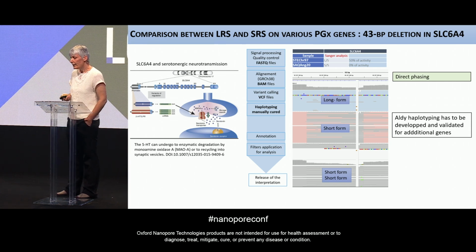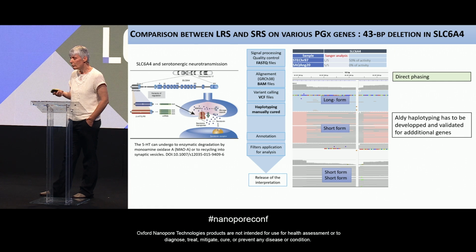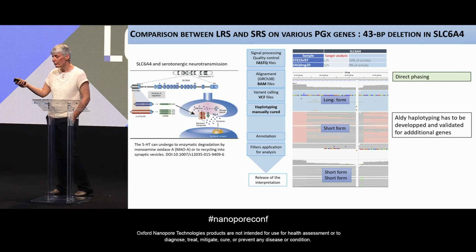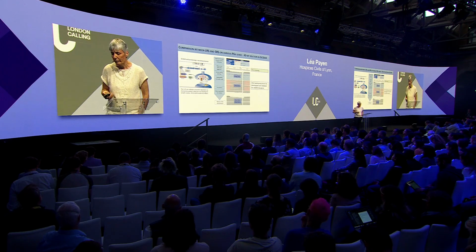As you can see here, we are able to detect the short deletion, 43 BP deletion in this promoter. And we can very nicely see the long form from the short form of this deletion.